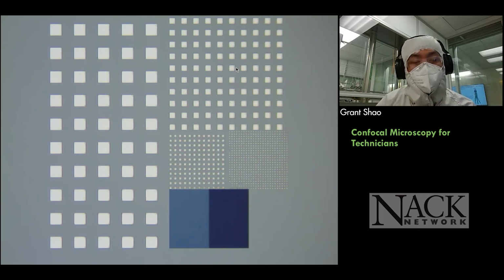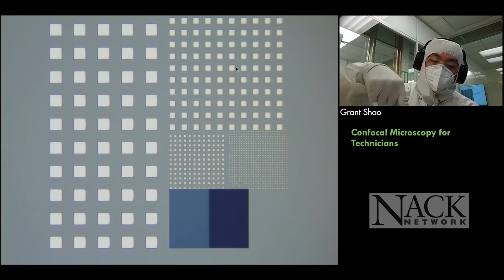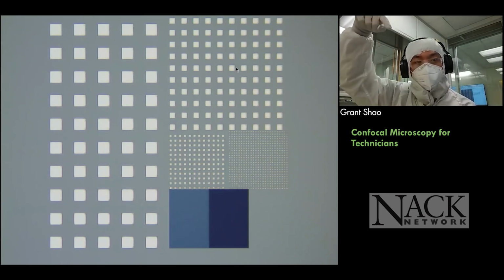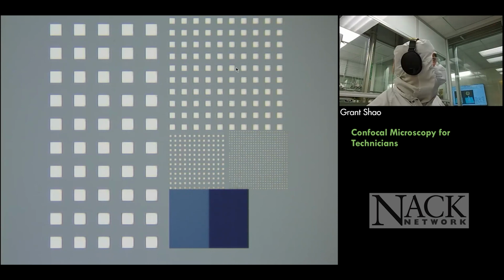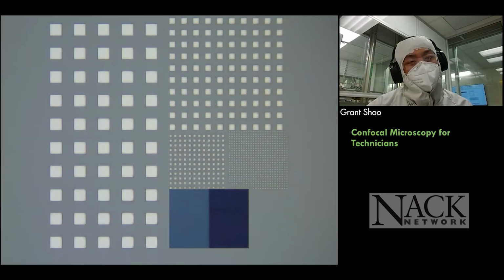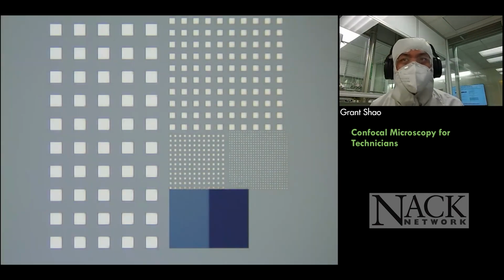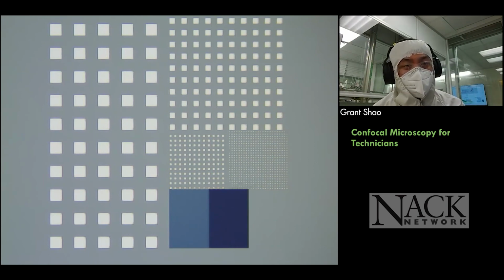With the profilometer, you're literally dragging a stylus across your sample, and sometimes when you bump up, there might be a little flip or something like that. Similarly here, it is with light, so you're going to get pretty good resolution, but because we are working with much closer to nano-sized features, a lot of times the wavelength doesn't quite get there. So you just have to look at your results, compare, and see what makes the most sense.